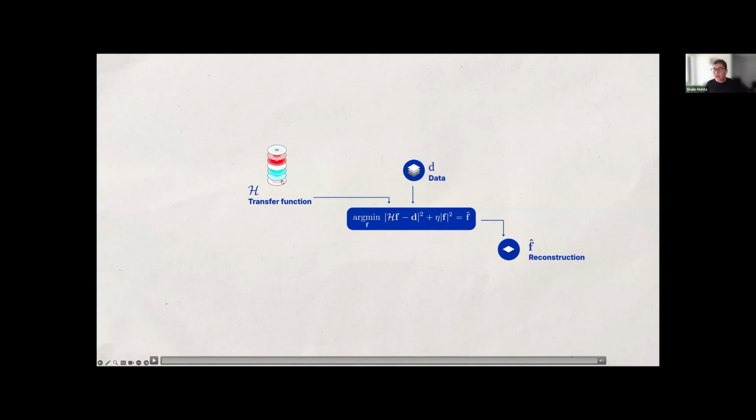We can model that as a bank of 7 different filters, and that bank really filters the spectrum of the object, and that results in the images. We have the actual images. So the optimization problem that we are solving here is: estimate the object f that best describes the data D, assuming the filtering operations specified by the imaging system, by the objective, the illumination and wavelength. And we have some regularization because this problem is ill-posed. So we have some regularization, that's standard Tikhonov regularization.